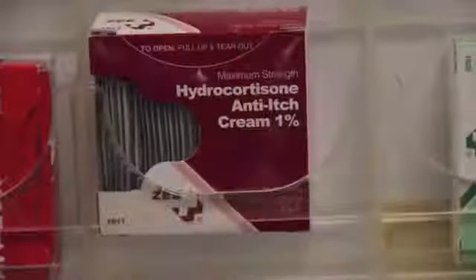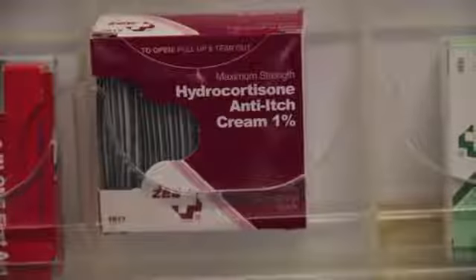Also, when wearing latex gloves, if your hand becomes itchy and burning, then it is likely you're allergic to latex. Take off the gloves and wash your hands. In the first aid kit, we have hydrocortisone pads to wipe the affected skin that should help reduce symptoms. Please be mindful of the scalpel as it is very sharp and can slice through the skin easily.